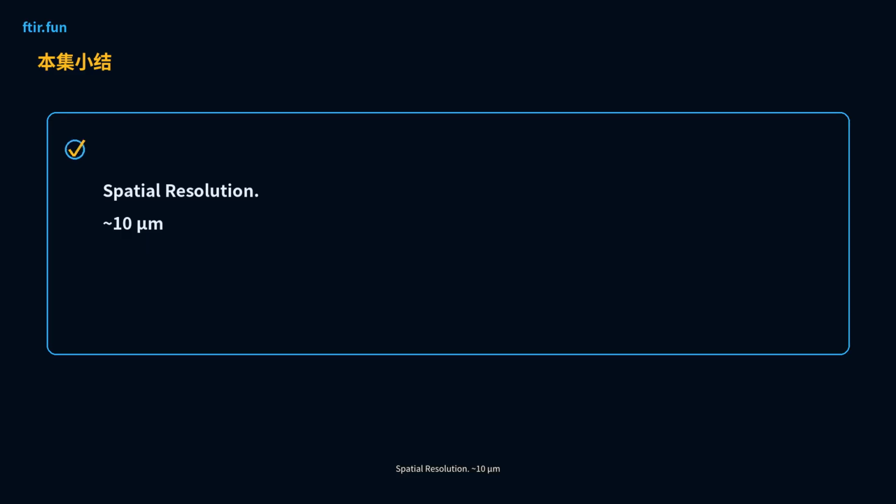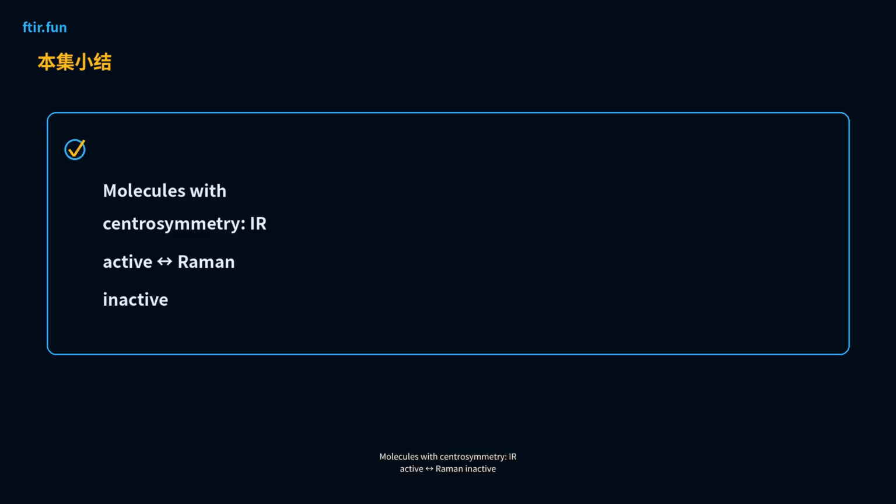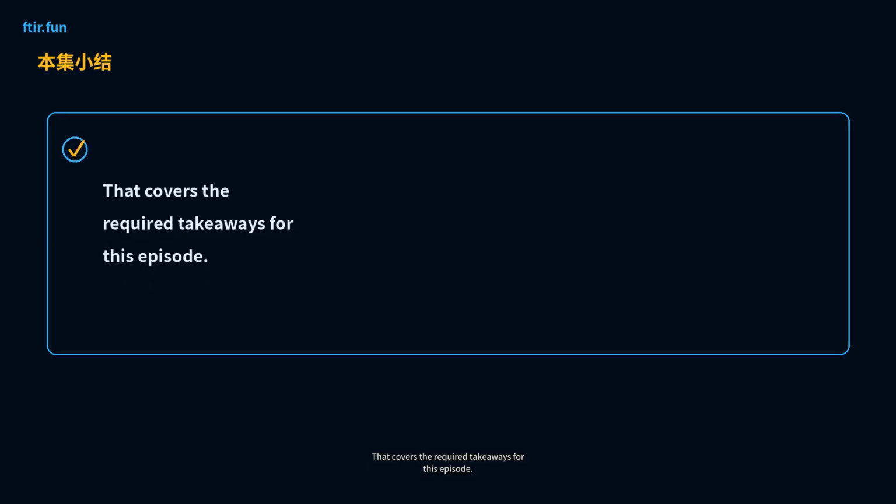Spatial resolution: 10 micrometers. Sample preparation: often required. Spectral library size: hundreds of thousands. Mutual exclusion rule: molecules with centrosymmetry. IR active, Raman inactive. That covers the required content for this episode.